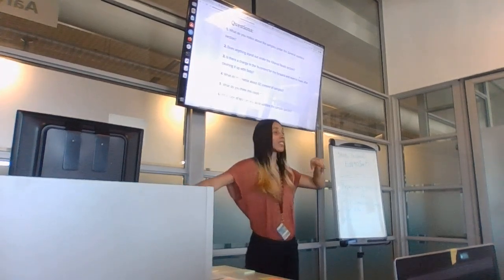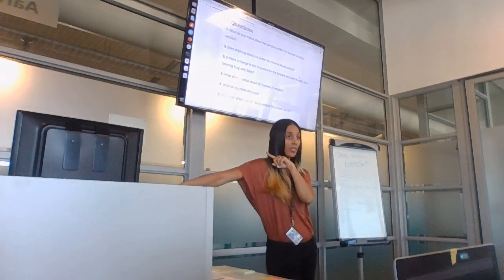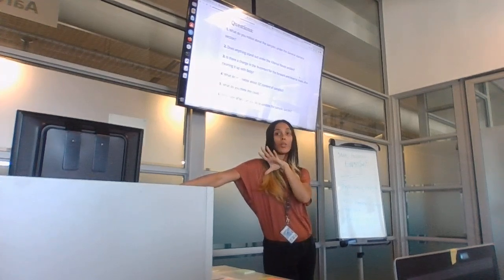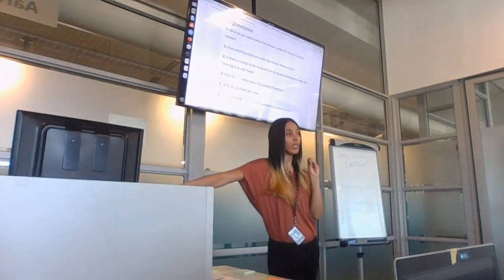You had viruses and bacteria. Exactly, so this is likely contamination. And more, you mentioned the GC content. Exactly, so you could see by the GC content that it was a different species. Okay, in this case I'm not going to let you do it because this runs. One of the things that you can do.